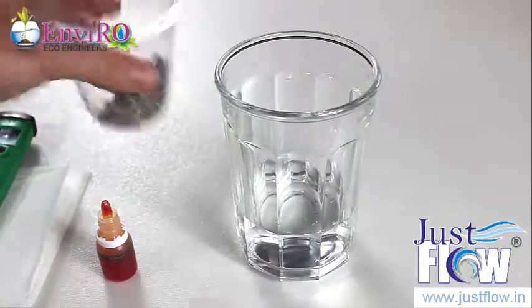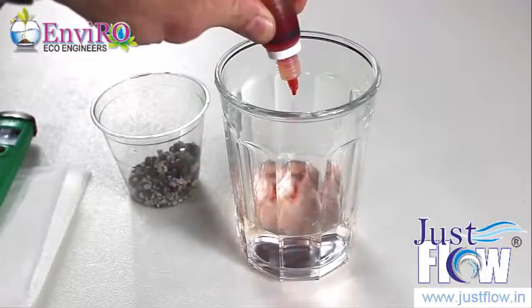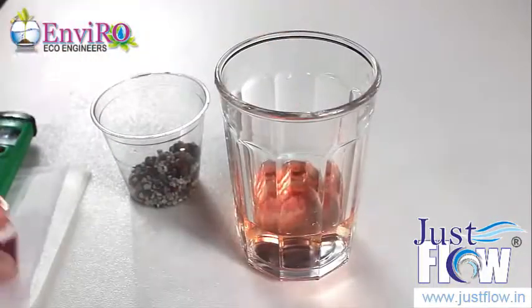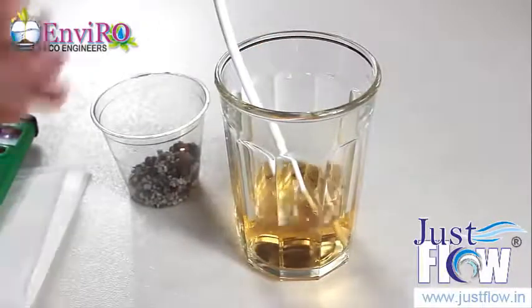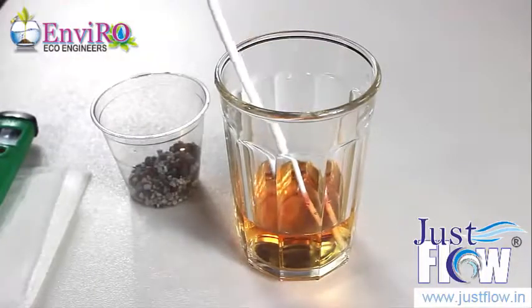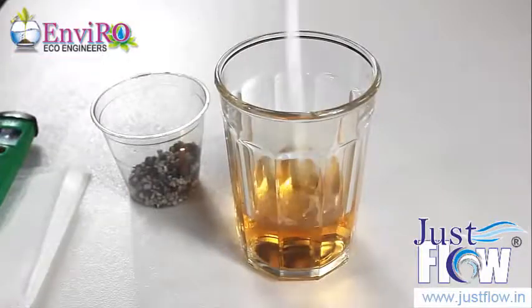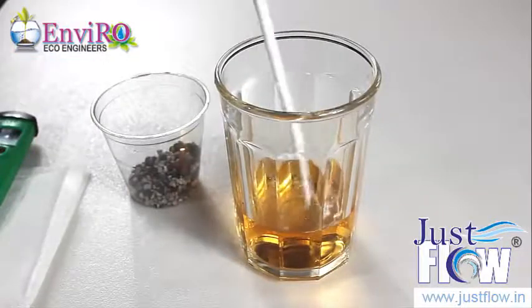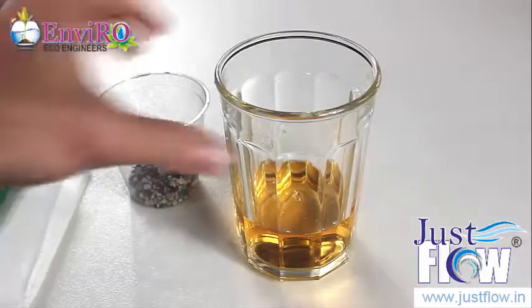And we're going to now add, actually before we do that, we got to check the pH. Put a few drops in here, let's see what we're going to get. Kind of is a yellowish tinge right now. It's a pretty good amount of water though, so I'm going to add some more drops. So let's figure 4. Yellow on this scale is in that 4 to 5 range. We'll call it a 4.